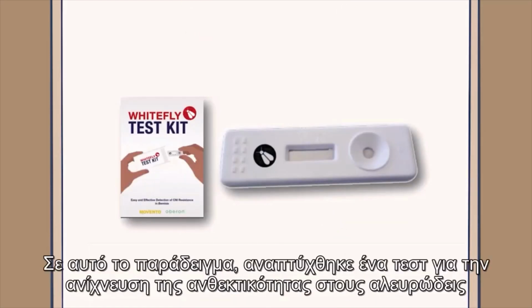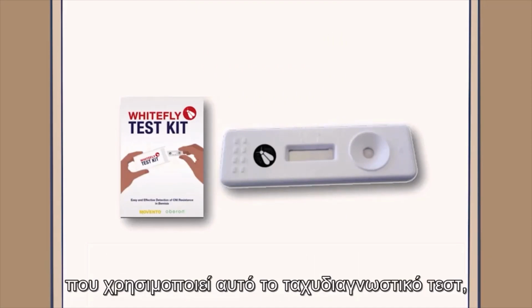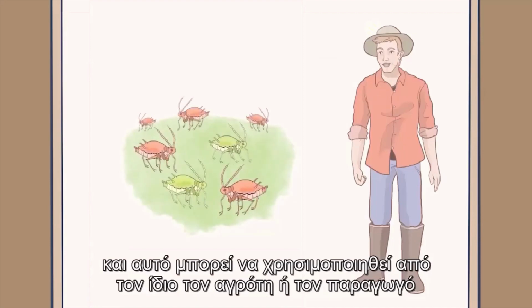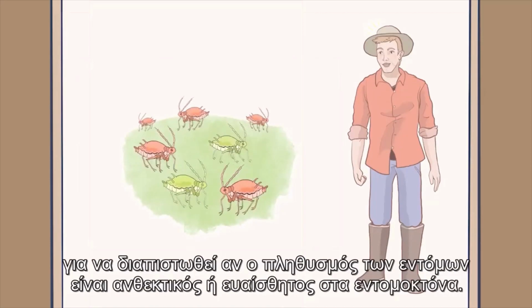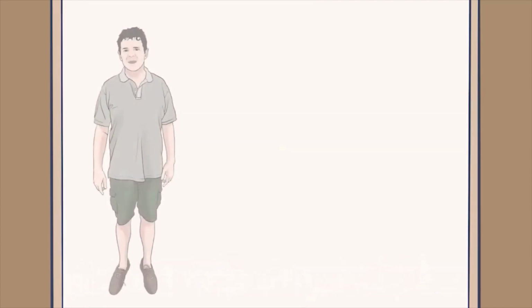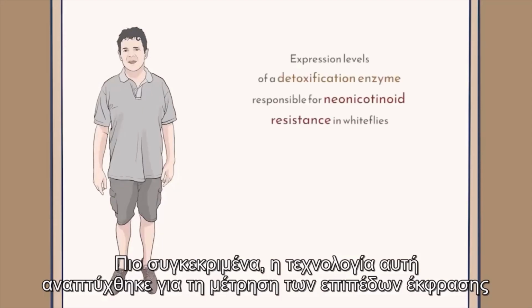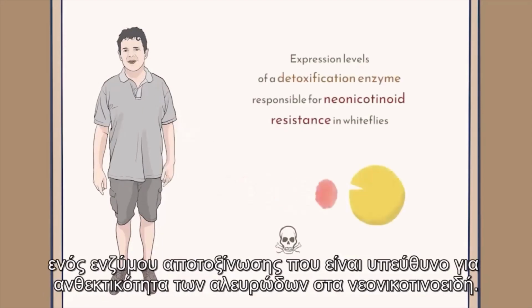In this example, a test was developed to detect resistance in whiteflies that uses this simple, rapid diagnostic test, and this can be used by the farmer or grower themselves to work out whether the pest population is resistant or sensitive to insecticides. More specifically, this technology has been developed to measure the expression levels of a detoxification enzyme responsible for neonicotinoid resistance in whiteflies.